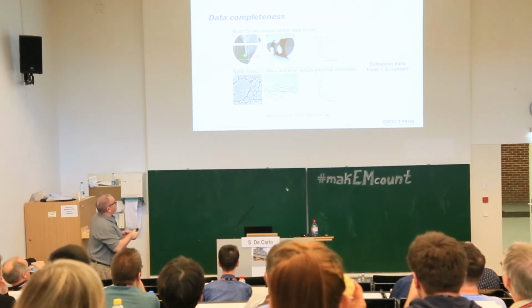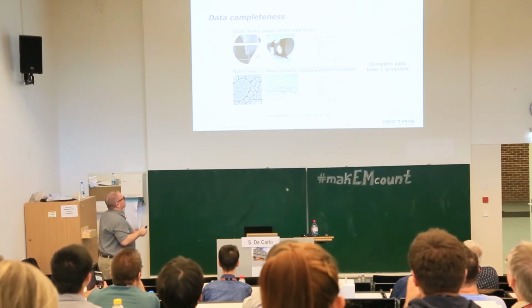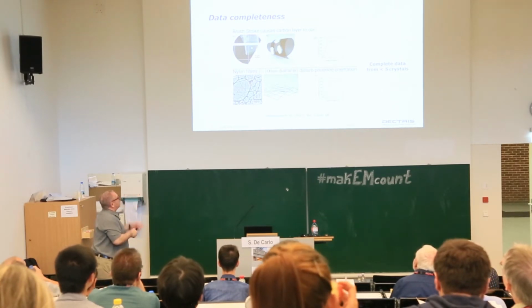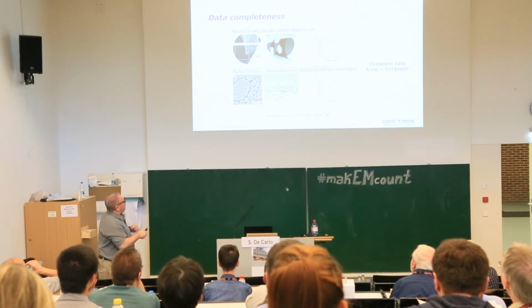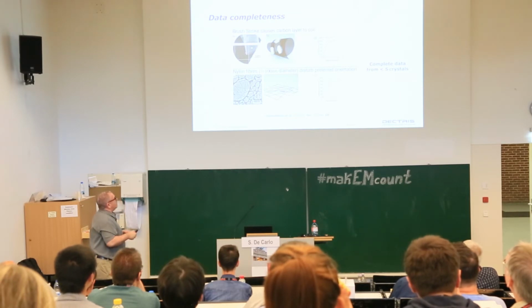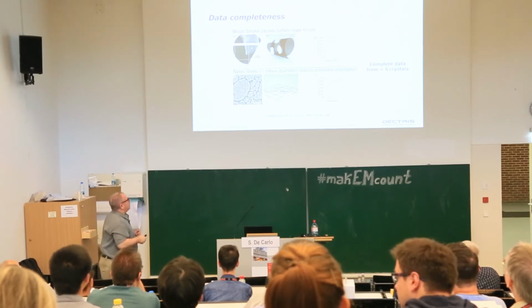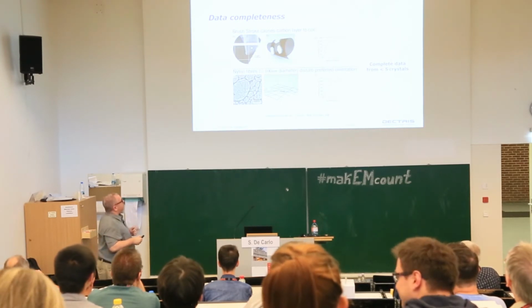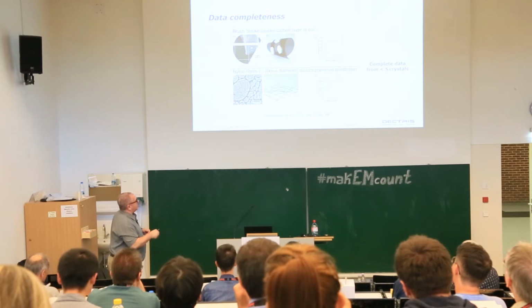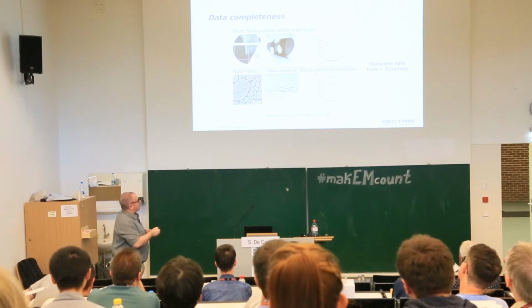You can take advantage of the fact that sometimes the carbon film curls, so it's offering different orientations of your crystal, and by merging 3 to 4 data sets you get to data completeness. The other method is the introduction of nylon fibers, which introduce a natural disruption of this network, and also here you have a way to distort the flat regularity of the carbon film such that your crystal is offered to you in different orientations, and you can collect data on a few crystals to reach the same data completeness with 4 or 5 crystals.